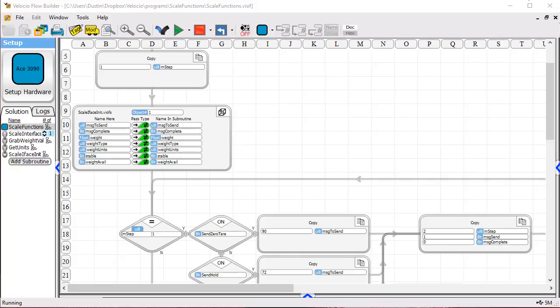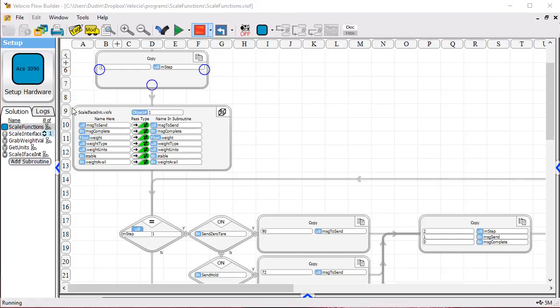Now let's take a look at how this program is implemented in vBuilder. As you can see, we've got a small program here that consists of a main program called Scale Functions.